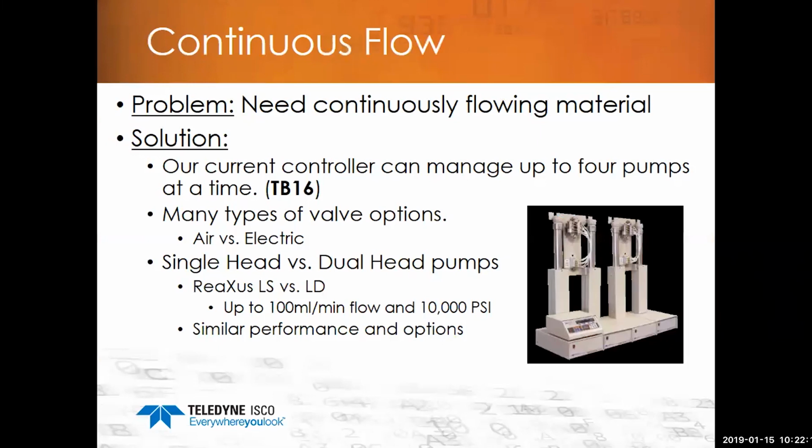First off, do you need continuous flow? That will tell you if you need one pump, or if you need a pump with two heads on it, which you're not going to find in gear pumps. You won't find that in diaphragm unless you use two pumps connected together, which is difficult. Peristaltic, same thing, you're not going to find that. So you're going to narrow yourself down to reciprocating pumps and potentially syringe pumps.